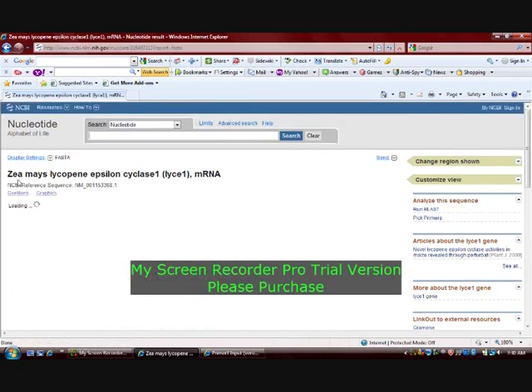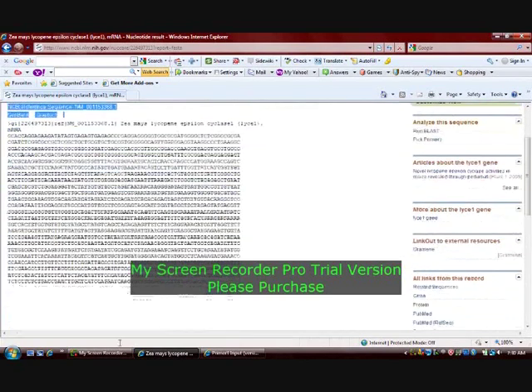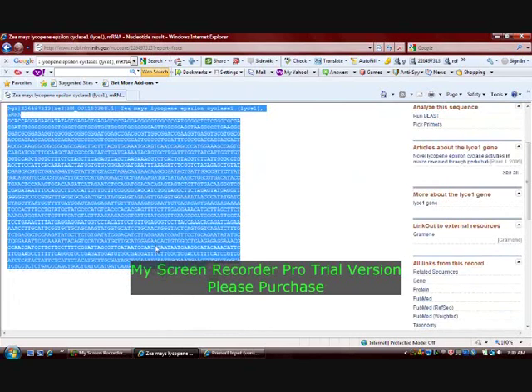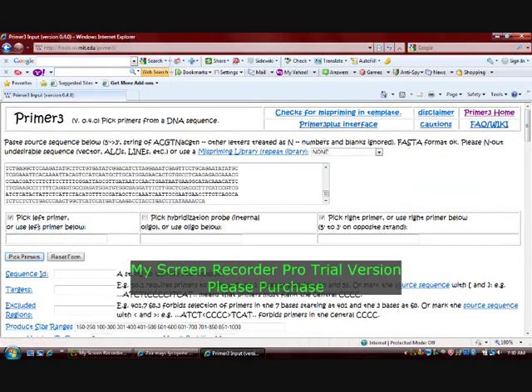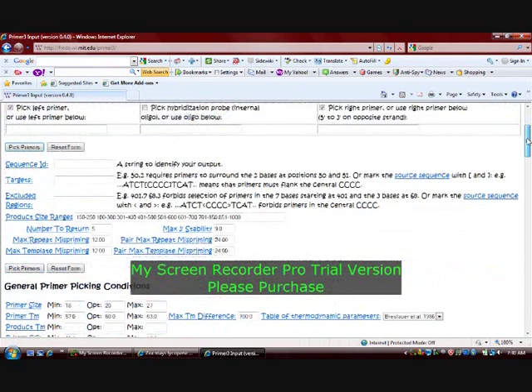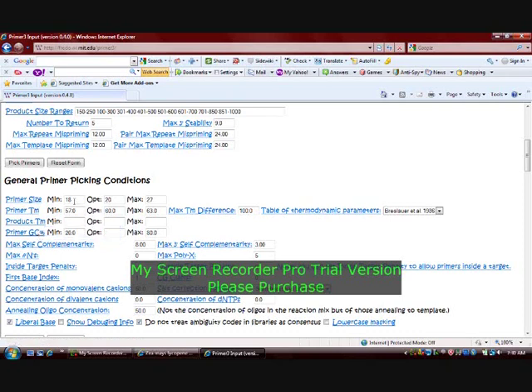We open the FASTA sequence, select it, then copy and paste it into the text box of the Primer3 designing software. Then the criteria mentioned earlier are to be set: the length varying between 18 to 27, and the temperature set with a minimum of 52 and maximum of 58 degrees Celsius, with an optimum of 55 degrees Celsius.